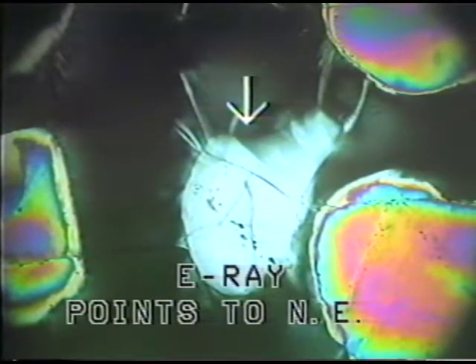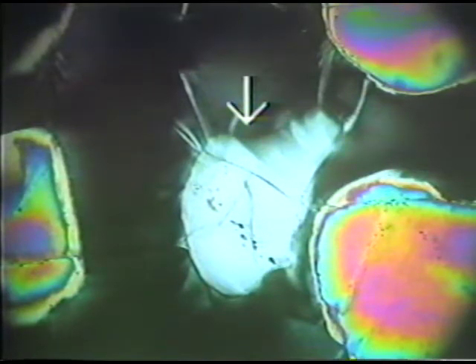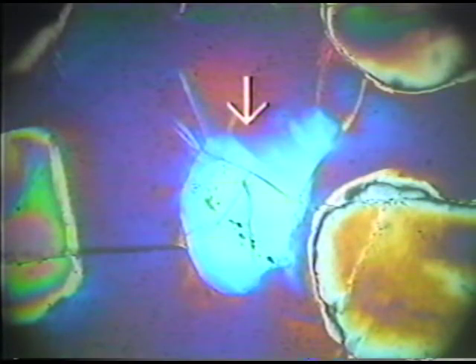Now I look at the mineral grain in cross-polarized light. I see a white interference color. The white interference color then can be tested using the gypsum plate. I insert the gypsum plate. Now I know that the E vibration direction is located here in this northeast quadrant. I know that the slow direction on the gypsum plate is also in the northeast quadrant. So I insert the gypsum plate and we look now at the mineral grain in cross-polarized light with the accessory plate, and you can see that it shows now a blue interference color.